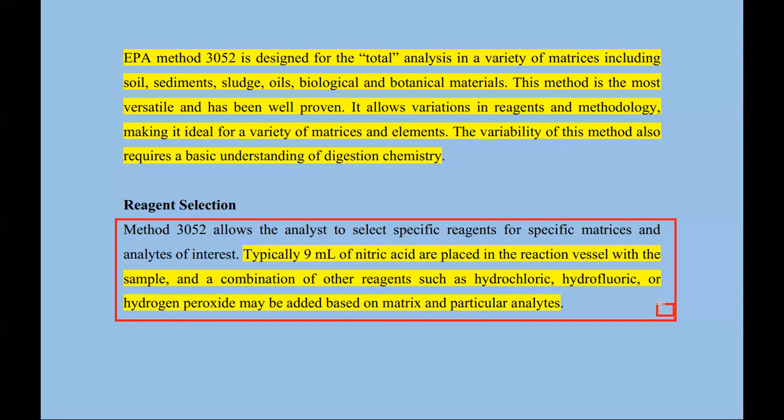But now, if you use nitric acid, because nitric acid is likely to contribute NO2, NH2, those are ligands. The amine, those are strong ligands that are present in most complexes, like EDTA, ethylenediaminetetraacetic acid. You find that there is an amine ligand there.